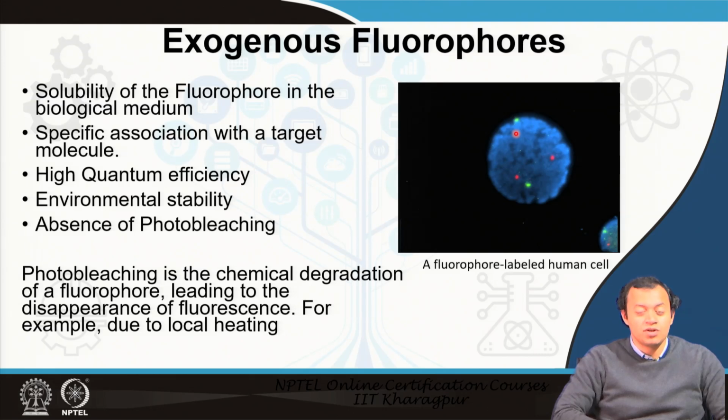Do not always quote me for saying 50 nanometer. I have got it at 60 nanometer or 65 nanometer, or even at 50 nanometer it is not coming, I had to go to 20 nanometer, or I got a beautiful image of that sample at 100 nanometer. It depends on the sample, on the wavelength that you are looking for, on how strong your evanescent field is, and on several other features, especially aperture, the distance, etc.